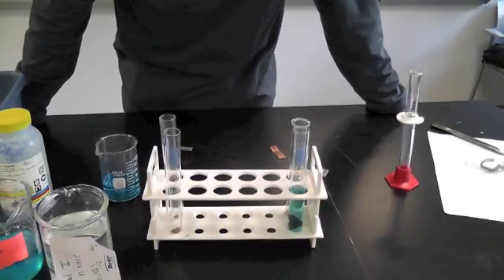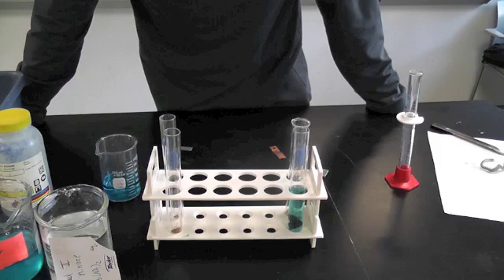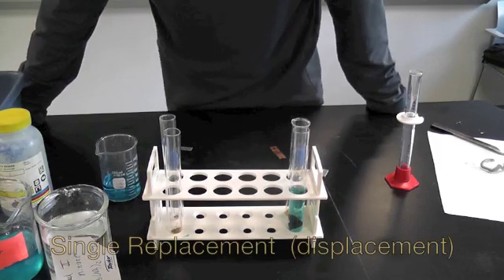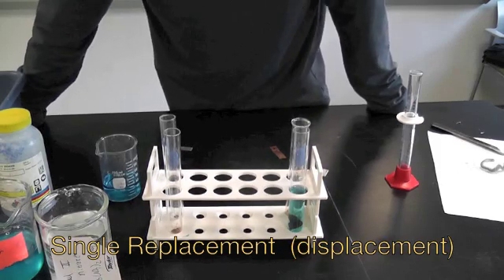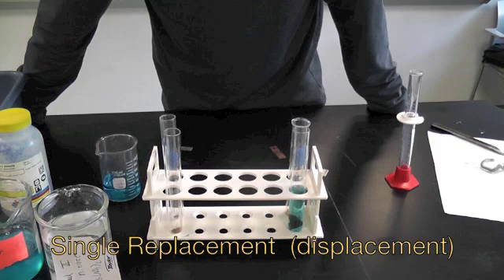Hello and welcome to another session of Seneca Chemica, where we're looking at some very simple reactions — single replacement reactions. These are very basic in general chemistry or entry-level chemistry, and sometimes they're called a displacement reaction.